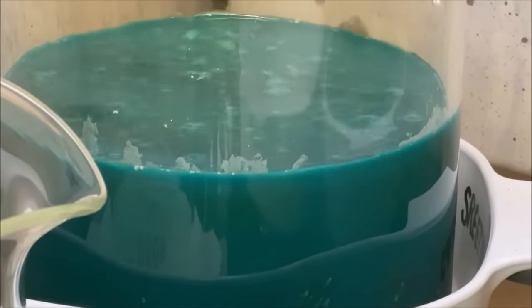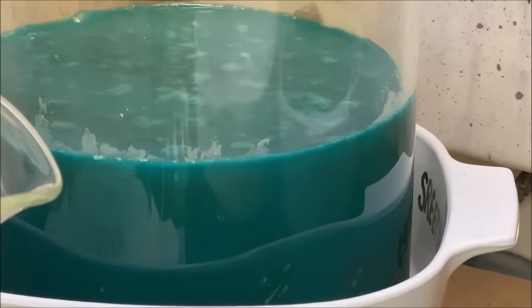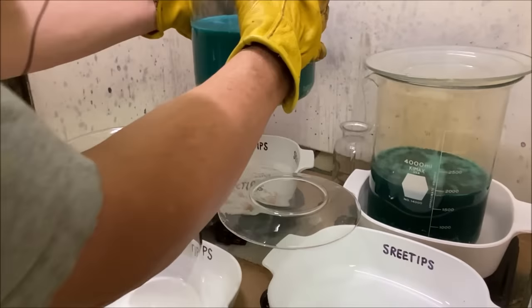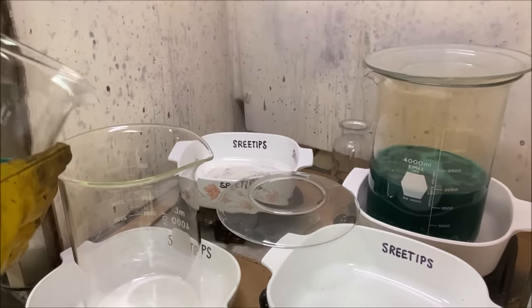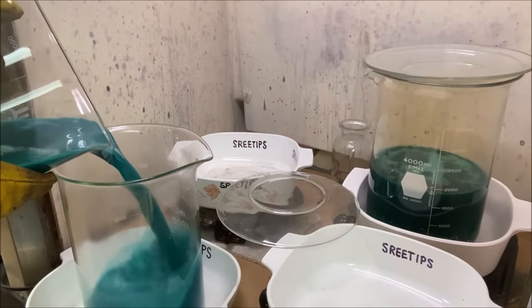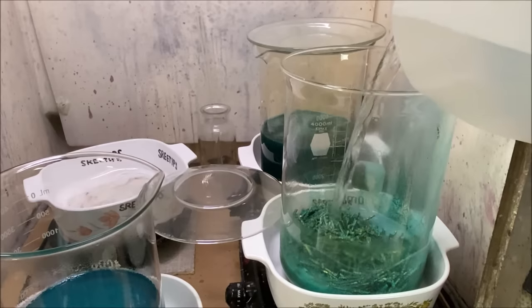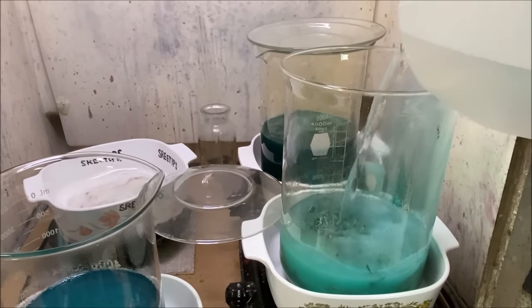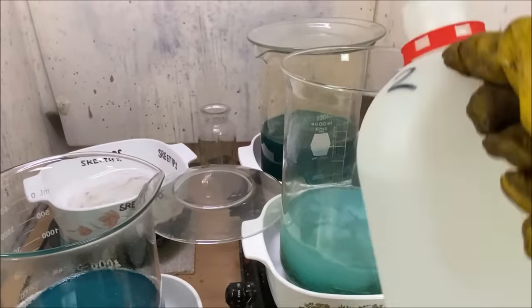I've got some kind of precipitate forming in that larger beaker back there. Not sure what that is. Yeah, it's on the bottom of the beaker as well. Oh yeah, it does not look good in here. So I'm gonna add some water. Now some more nitric acid. We'll just keep going.